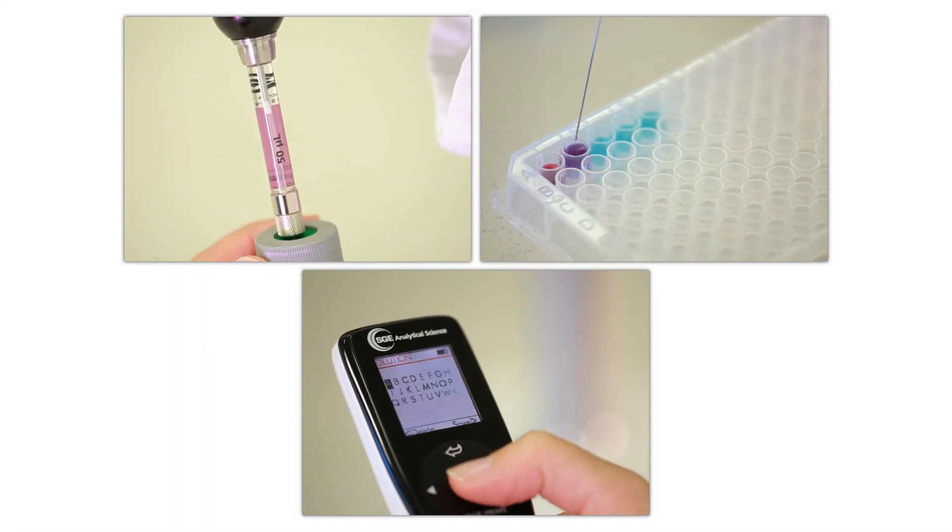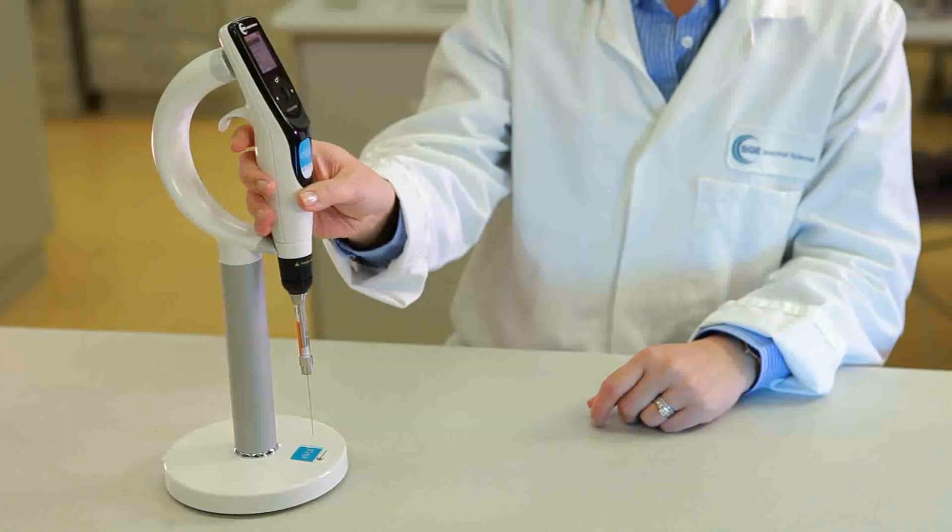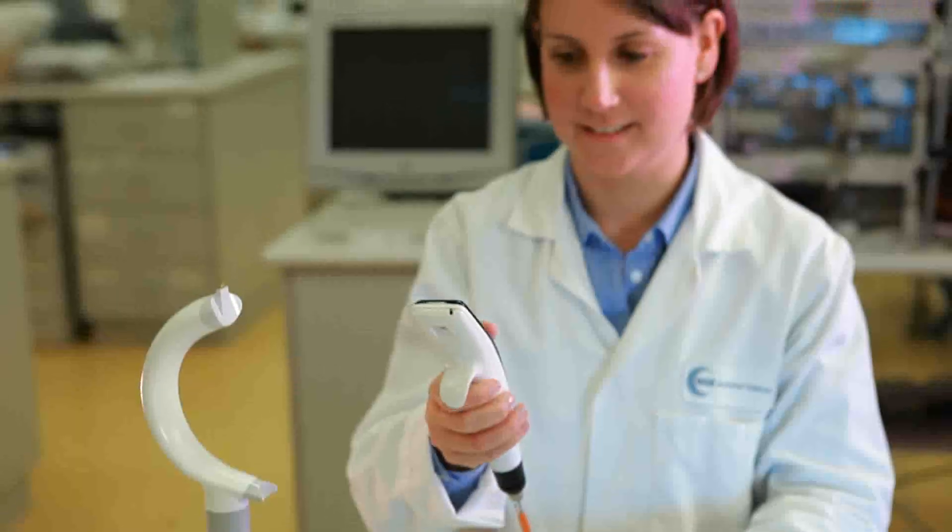In this video, learn how to further extend your EVOL's capabilities by using innovative features not found in any other handheld positive displacement device on the market.